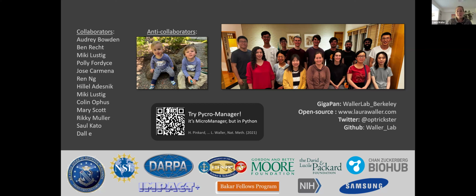it works there, because there's a chance you could then basically get a video at the frame rate of your data capture. So if you take 300 images to reconstruct one frame, you can actually reconstruct a video with 300 frames from it, which seems crazy, but this is the power of what you can do if these models work well. And these models work well if your motion is relatively smooth, which is kind of hard to describe, but if it's modelable by these models, then you can potentially get back all of the lost temporal resolution, which is pretty incredible to me and exciting.